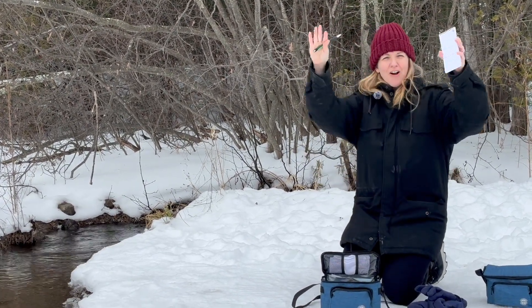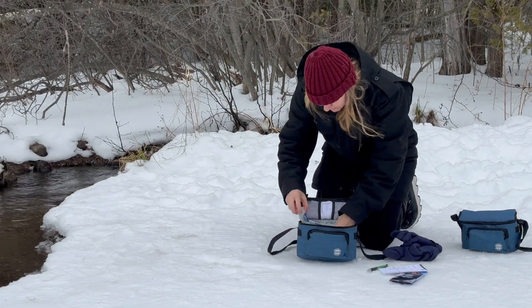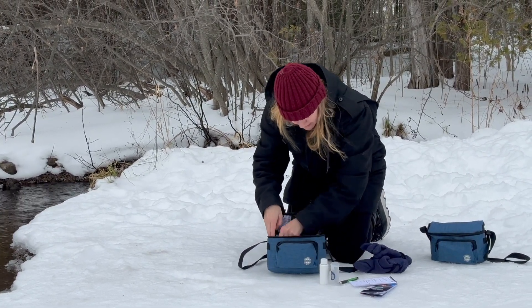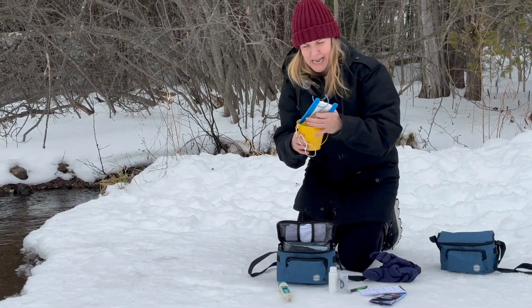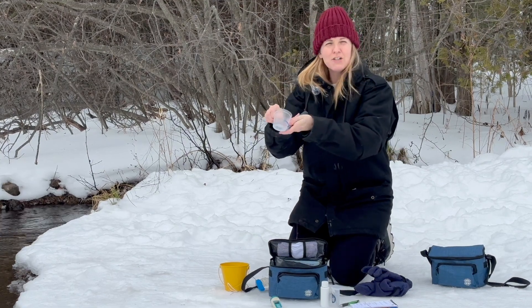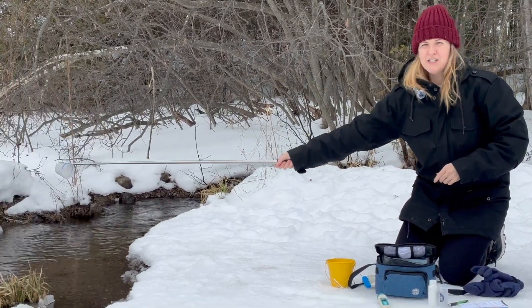Now that we've added our context, we're going to start our tests. In your test kit bag you've got various items: test strips, a conductivity meter, and two ways to collect samples. The first method is using a sample cup on what we call a reacher stick. Secure it in here, extend the pole, and then you're able to reach the water.